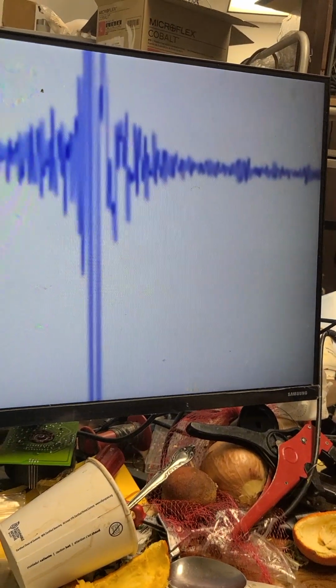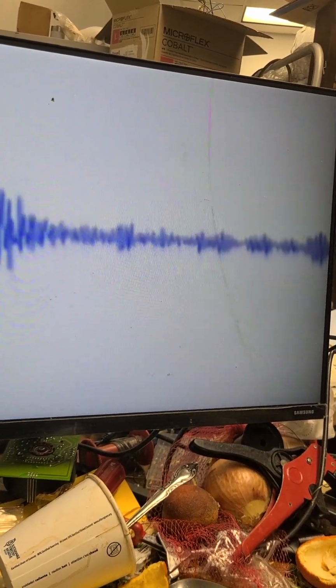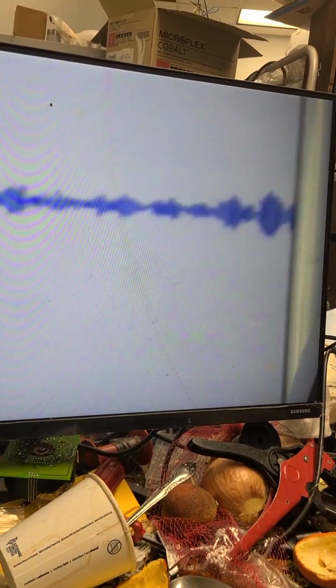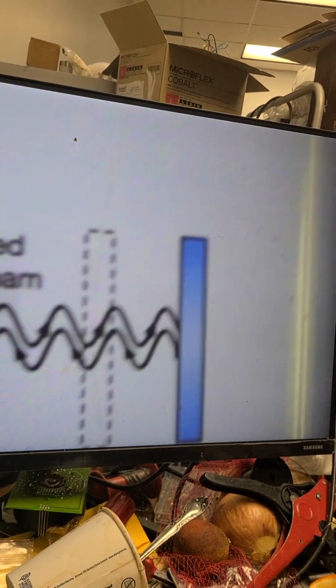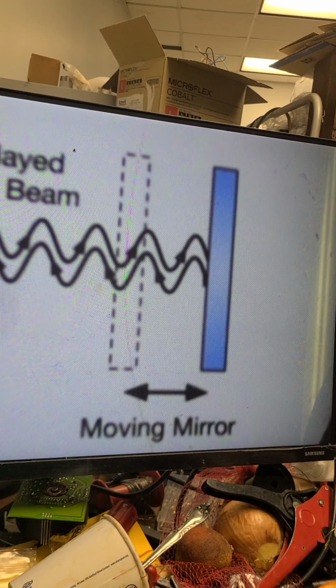Only after about, let's say, 1/4 millimeter or 1/3 of a millimeter, you no longer get much at all of the constructive and destructive interference, because of the limits of our ability to move that mirror totally vertically, or totally unwibbly, no wibbly wobbly going on with that mirror movement in the infrared light.